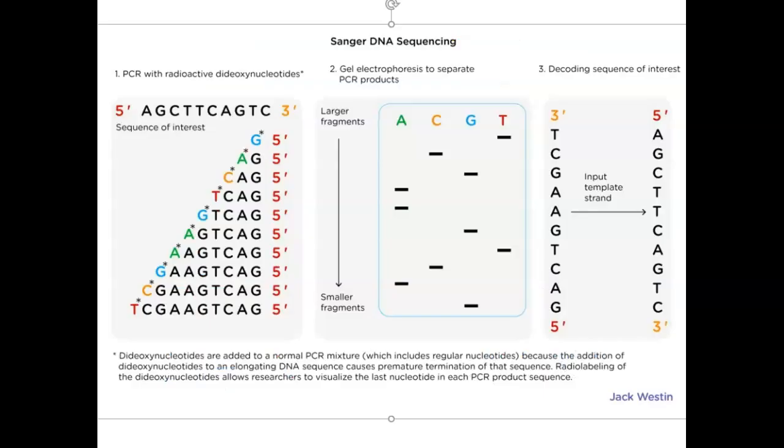A more fundamental type of sequencing is called Sanger sequencing. I actually do this a lot in my own work. It's also become way cheaper. This can be used to sequence generally DNA strands from around maybe 70 to 80 base pairs on the lowest end, up to maybe 1,000, maybe 1,500 base pairs on the high end. So this would be where you've already isolated a particular gene or area of interest, and you just want to sequence that.